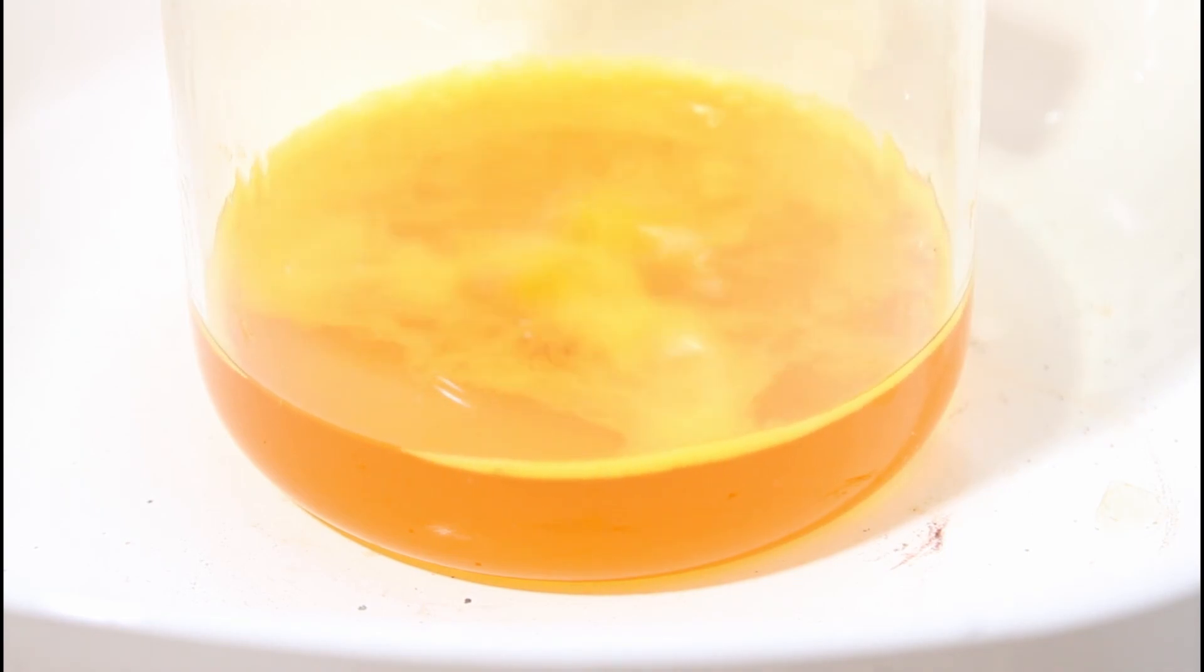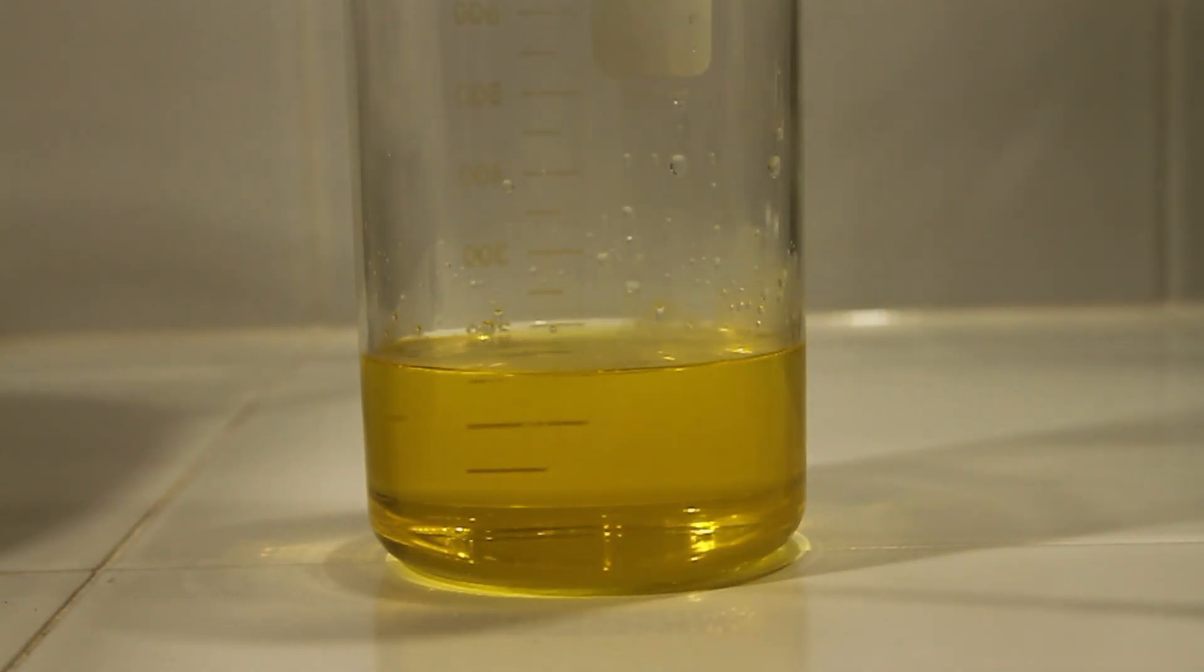Now after we take it off the heat and let it cool, we're going to add a chemical called sodium metabisulfite. It can be purchased at Ace Hardware, it's Stump Out.